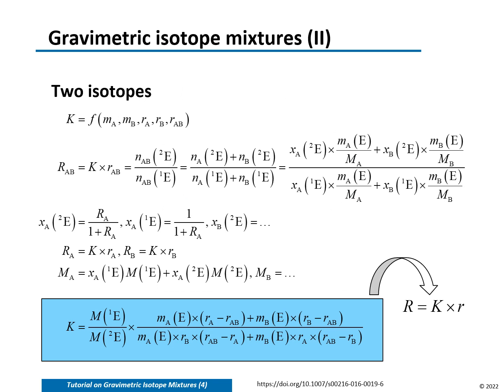The K factor is then simply a function of the two masses, MA and MB, and of the three signal intensity ratios that still differ from the wanted isotope ratios. You have to keep this in mind. This function is usually derived from the definition of the isotope ratio RAB in the mixture, the isotope ratio, not the signal intensity ratio.